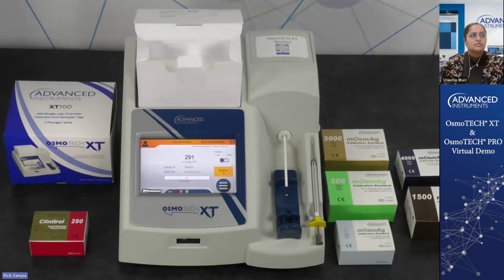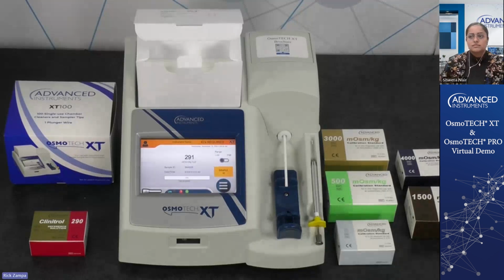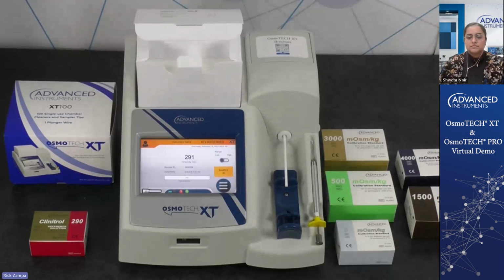But generally speaking, you'd want to bracket your sample value with controls. So in this particular case, let's say our sample is 290, you'd want to do something above that, say maybe a 300 or a 400, and something below that, maybe a 200. Some of the references say you should be, no, they changed the 50. It's wider than that now. So yeah, if you're within 100 milliosmoles of each one, you're good in bracketing your samples.